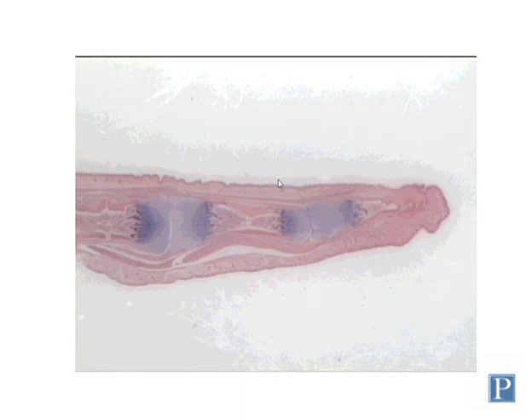Moving along, this is a section of a fetal finger. So it's a tiny little finger here. You can see the three segments, or three phalanges, of the finger here. So here's the distal phalanx, here's the middle phalanx, and here's the proximal phalanx. You can see the epiphyses of these developing bones are composed mostly of cartilage here, and the matrix of cartilage, hyaline cartilage in this case, is more basophilic. It has a glassier appearance, so that's why the epiphyses of these bones appear that way, have kind of that bluish color to them.